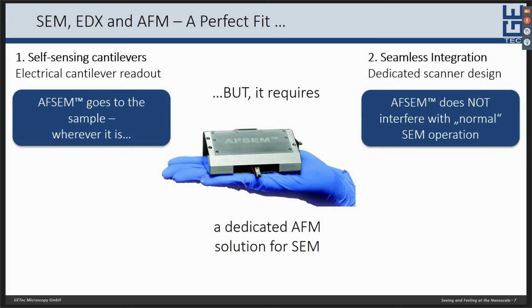Second, due to our dedicated scanner design, we are able to make a seamless integration of the AFSEM in almost any commercial SEM or dual beam system. This is a very important point that I want to make, because the AFSEM does not interfere with the normal SEM operation. For instance, if you can work in your SEM with very large samples, like for instance a 4-inch wafer, you can do the same in combination with the integrated AFSEM.